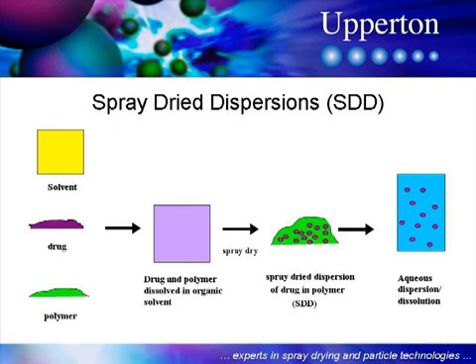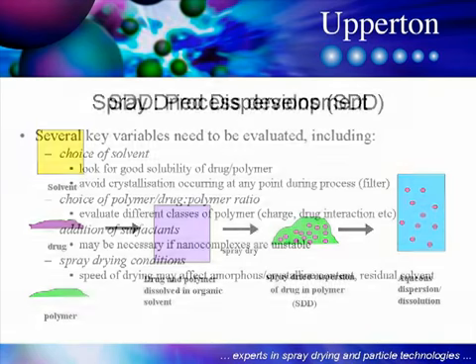When the spray dried dispersion is placed back into water, the polymer dissolves virtually instantly and the drug is released as a nano suspension, with a subsequent increase in dissolution and ultimately bioavailability of the drug.